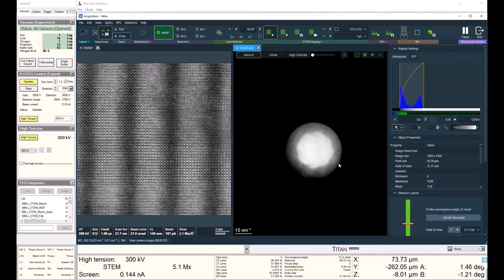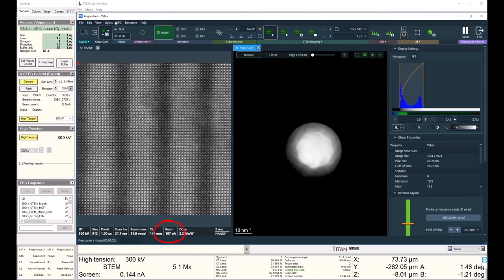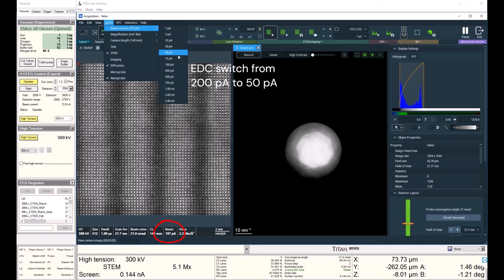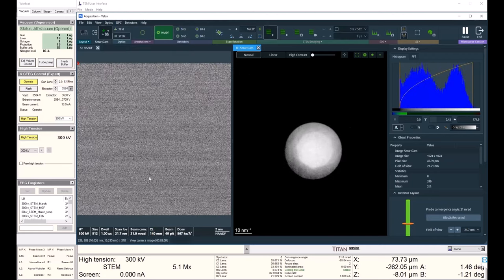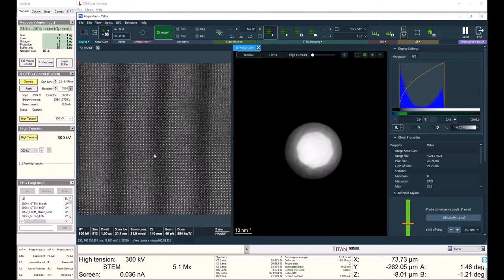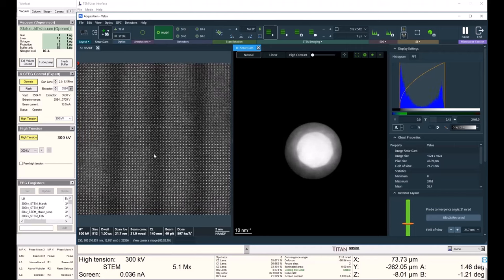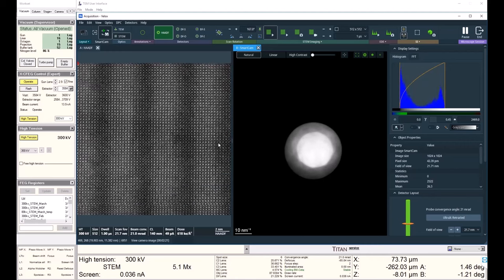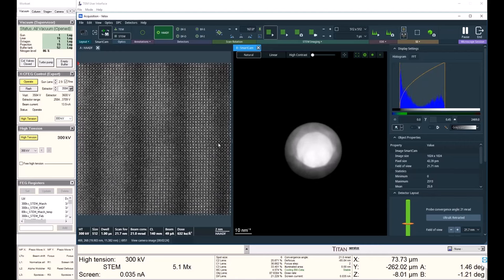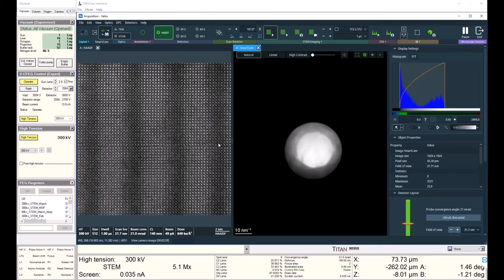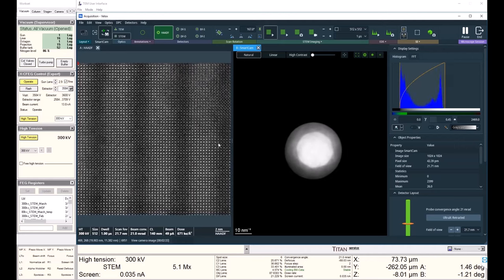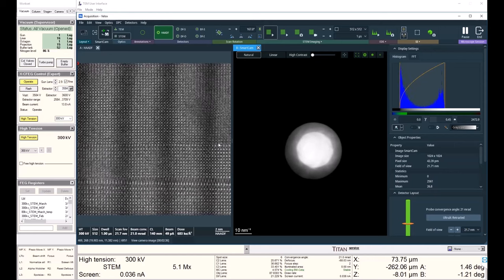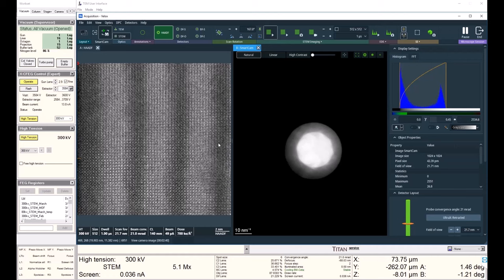And right now I'm actually at a pretty high current. I'm at 200 picoamps. I want to start with imaging, so I'll go back to a 50 picoamp beam current. I can see my nice lattice here. Just use the piezo stage to get to an unbroken area.